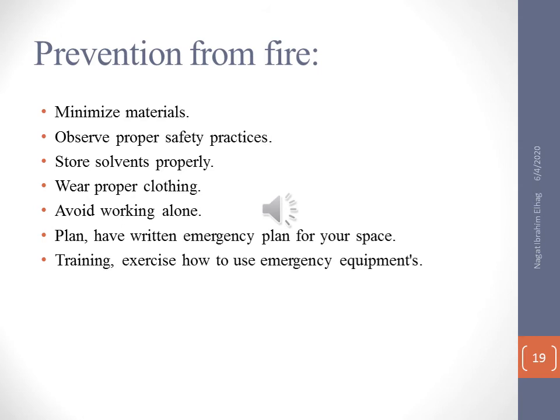If you have any excess materials that are not used in your lab, you have to discard them immediately, such as empty boxes.